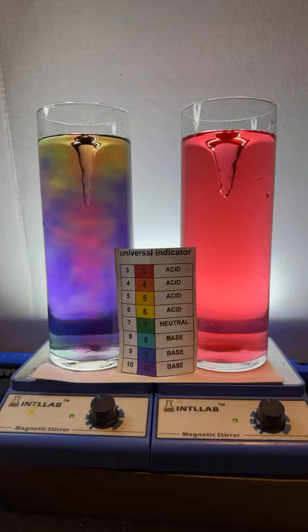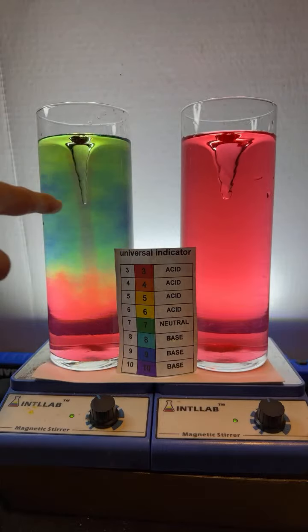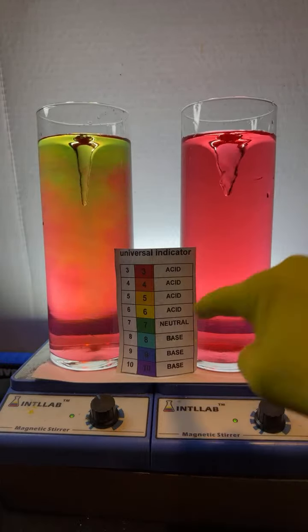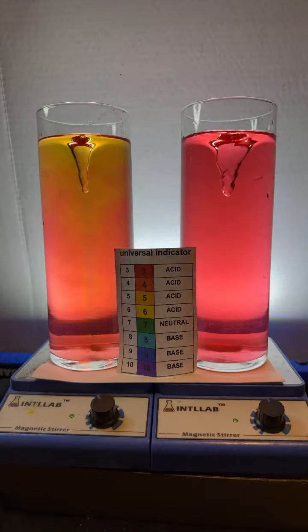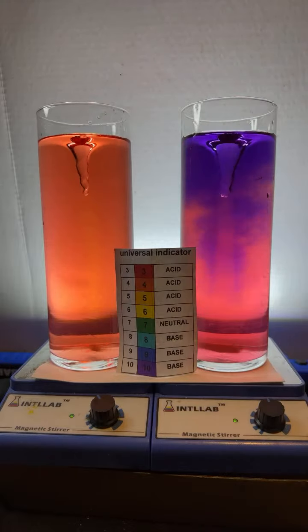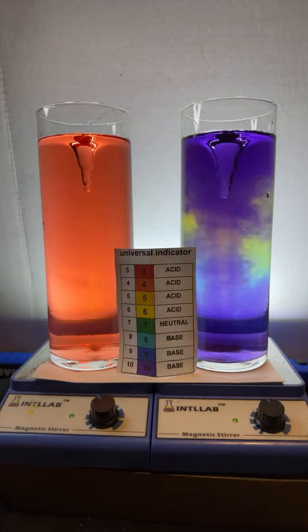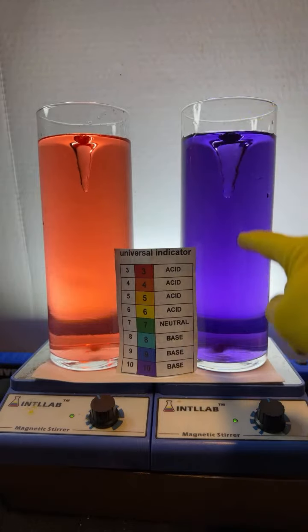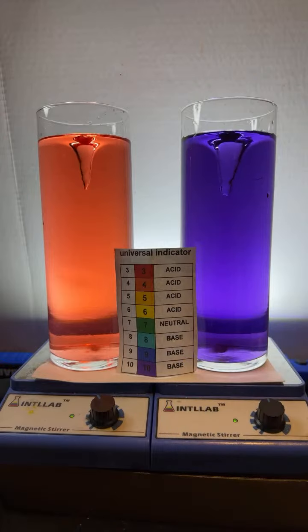Add acid into base. That's what I just did over here, but I'll do it again for you. Look at that. We got the chemical traffic light going on. Over here, I have acid, pH 3. I'm going to add base into it. Here we go. Add a drop of base. 1 drop. The acid and base are reacting with each other. Look at that gorgeousness. It looks like I added an excess of base because I shot straight through neutral all the way to pH 10, which is basic.